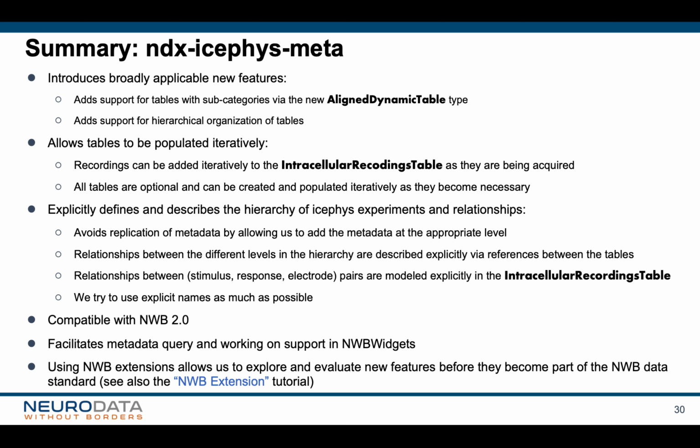So this again allows recordings to be added iteratively as they're being acquired. So this approach is amenable to how data is being generated in a lab. All tables are optional and can be created and populated iteratively as they become necessary.